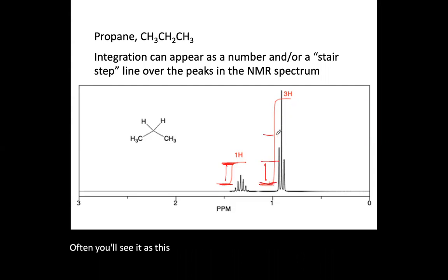And if I had a ruler, I would say, okay, there's 2, and this is close to 3, and I didn't do it very carefully. 3 hydrogens. So this is a 1 to 3 ratio, and if I split this in half, that's 1 to 3.